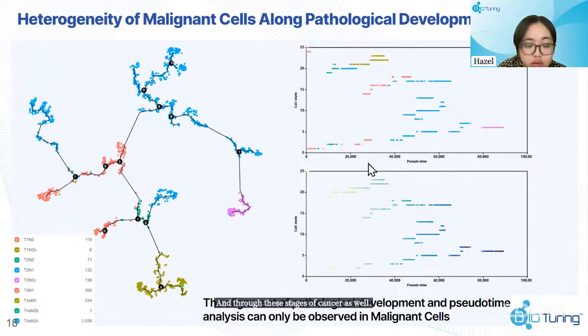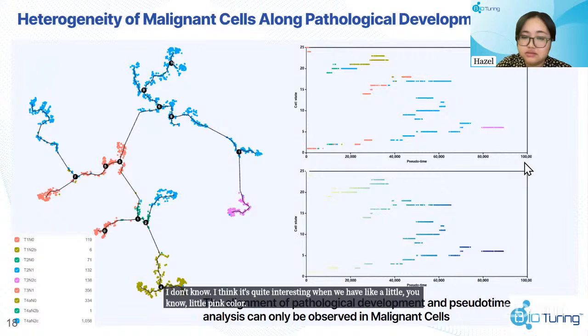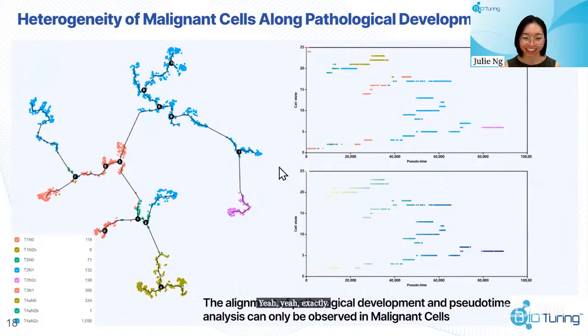And then finally, in this last graph, we see this is just looking at the distribution of the cell states here. And so as the color changes, the algorithm will define these different changes in color as a new cell state.